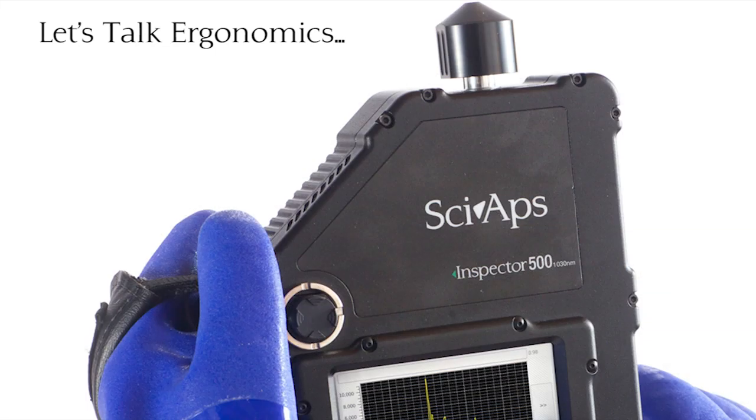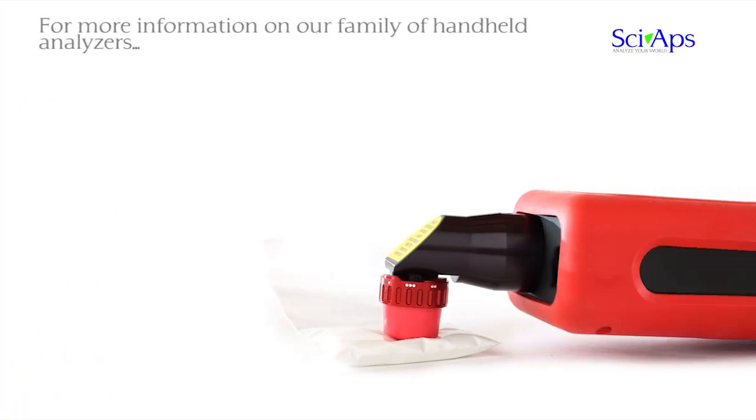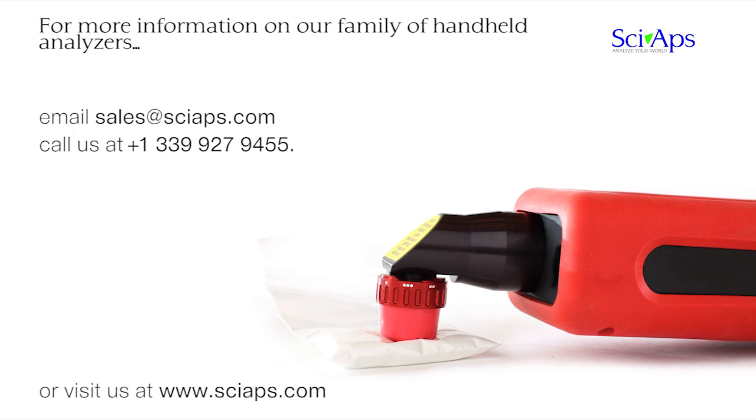It's truly a one-handed tool unlike many competing more boxy analyzers. For more information on our family of Raman handheld analyzers, please contact sales@sciaps.com, or call us at +1-339-927-9455, or visit us at www.sciaps.com.